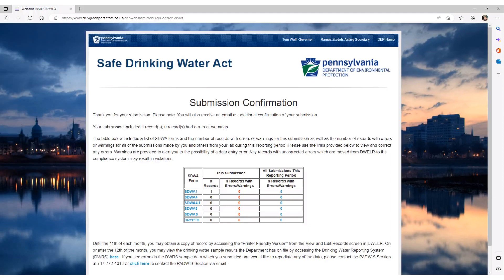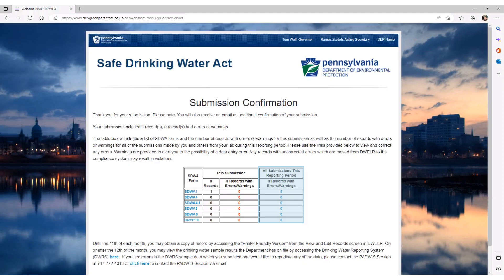We are returned to the Submission Confirmation screen. Here we can see if revising the record eliminated the error or warning. We can see that the second line tells us we submitted one record and that there were no errors or warnings. However, don't forget that DWELLR is telling us that there are previous records submitted during the current reporting period associated with your laboratory ID which still have errors or warnings. Remember, warnings are just that — the system is warning you that there could be an issue with the data you submitted. For example, an MCL exceedance. If you receive a warning, you should double check your data. A warning could be data that may not require correction.